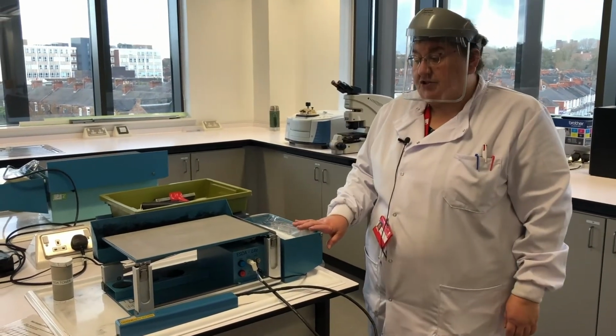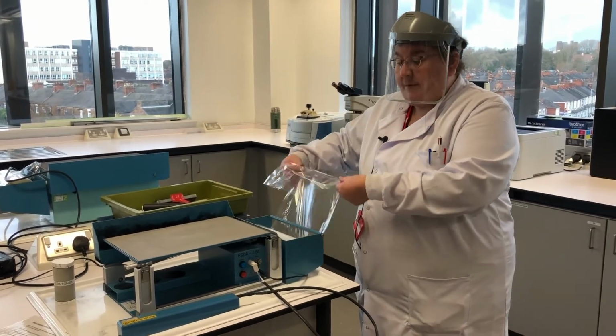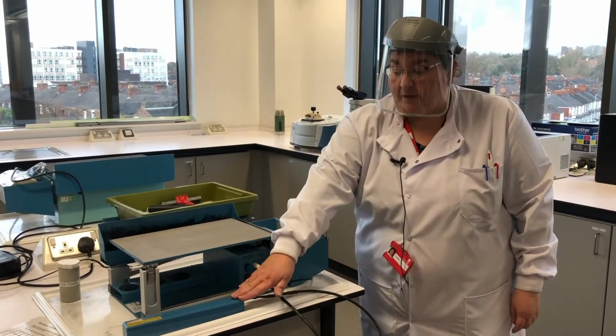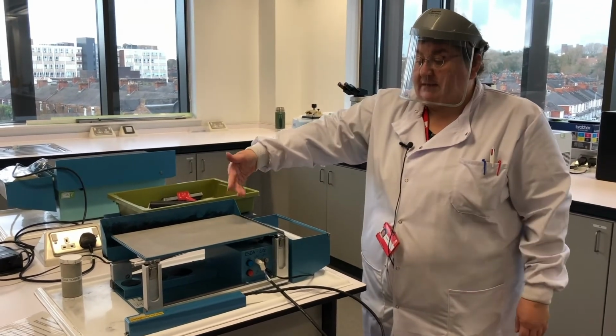We've got our ESDA machines, which is our electrostatic detection apparatus. And here the students will have a suspect document that they will put on the platform. They take a film over the top, and this then allows them to subject it to a charge, and this highlights the indentations in a page.